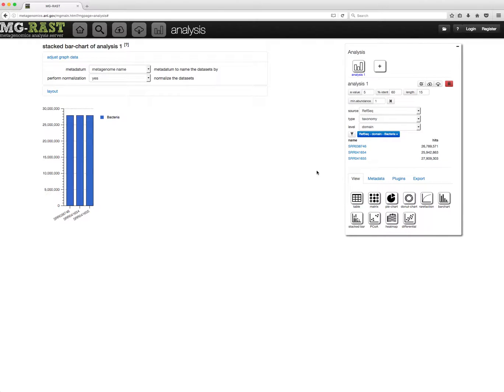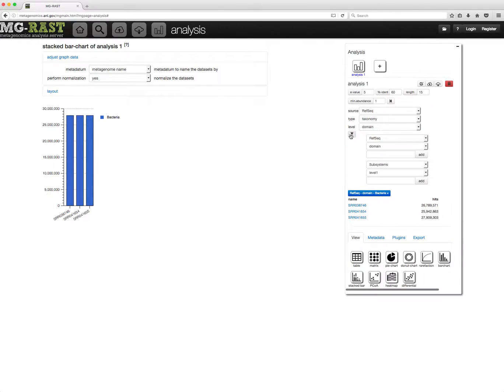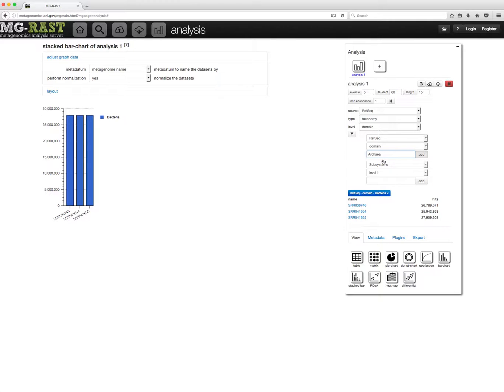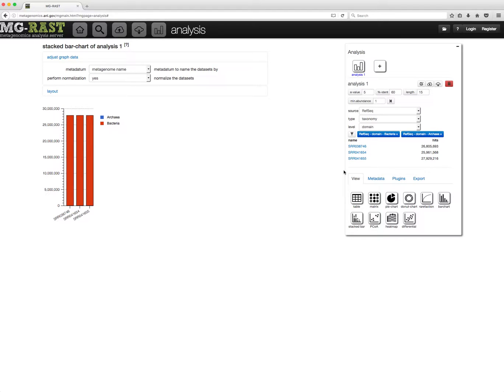You can add multiple filters for taxonomy. They will be treated as OR filters, so in this case it will show all hits which are either bacteria or archae. You can remove a filter by clicking on it.